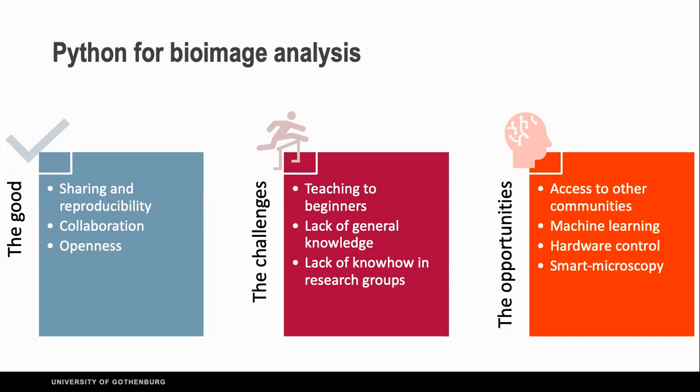And that's what ImageJ or Fiji is great at. You can just install it and start playing immediately. This is really what the community is trying to do with Napari. Napari now has a way in which you can install packages and run them directly from the viewer, so it gives you a feeling of Fiji. That's one of the things that we're moving forward.